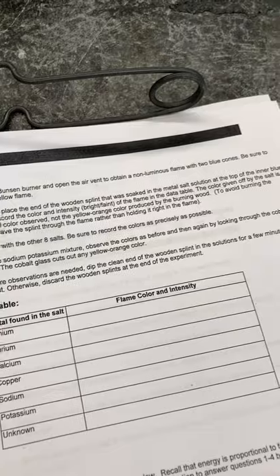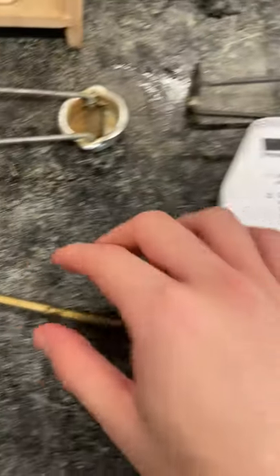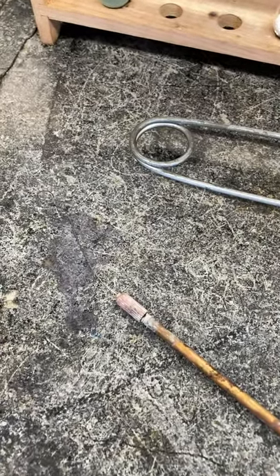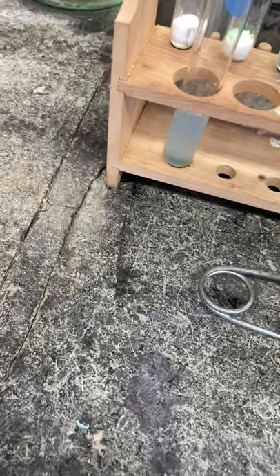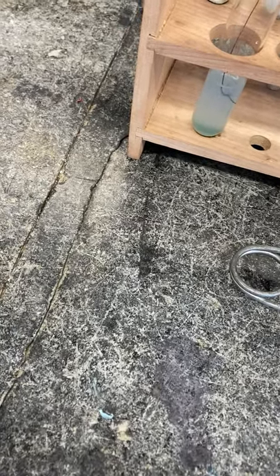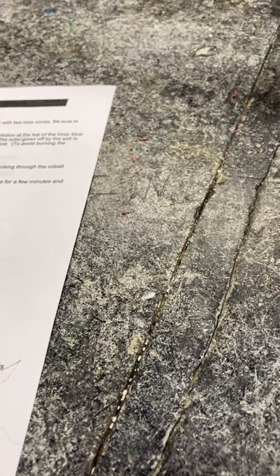Carefully place the end of the wooden splint that is soaked in the metal salt. Okay. So this... What metal? Oh, we need to know what salt is. Which one is salt? Metal salt. Yeah, the salt. Probably this one. What is that? You dip it in here. And then you think this is salt? Which one is salt? We just ask him. Yeah. Oh, wait. They're all metal salt, I guess. No. Metal found in salt. And they're all salt.